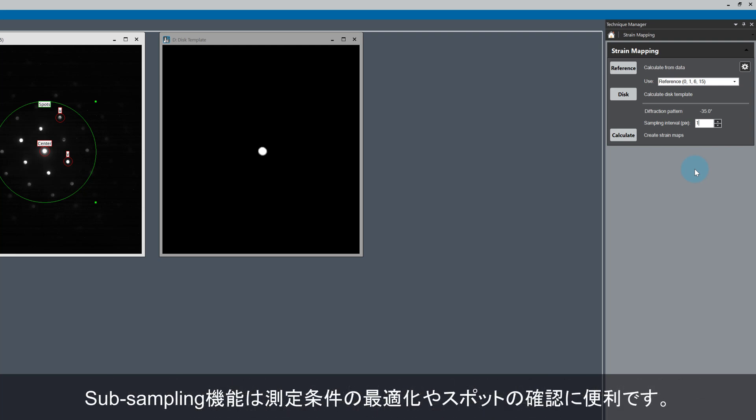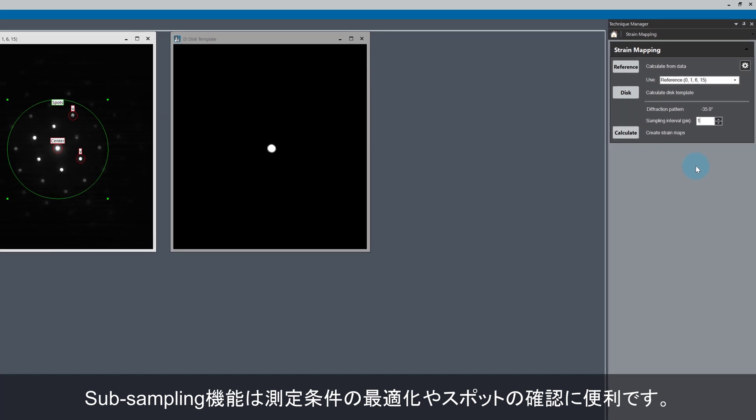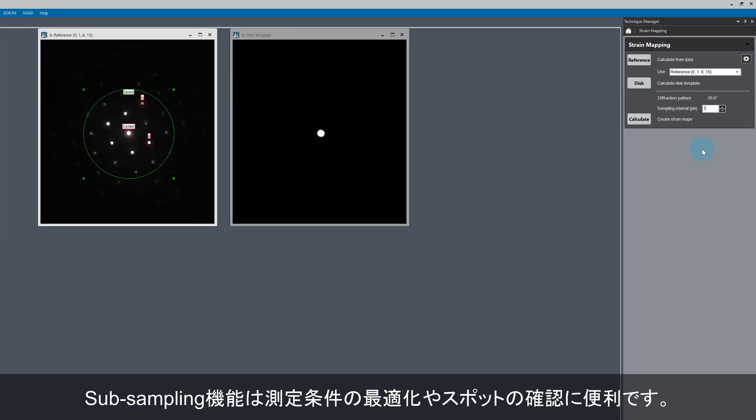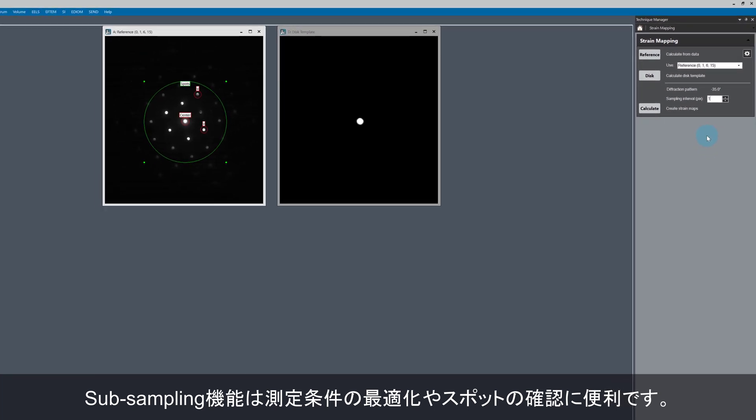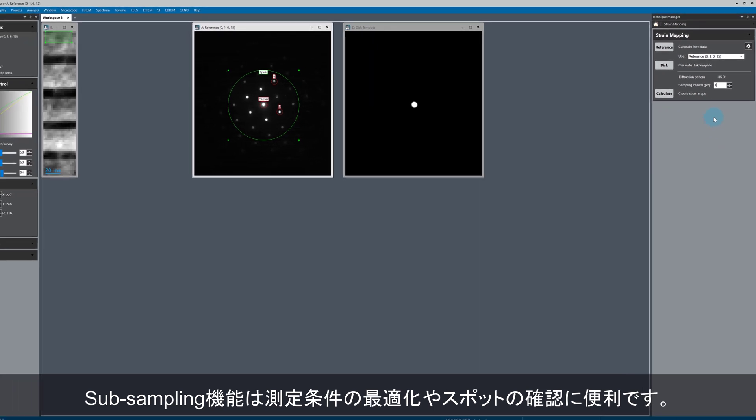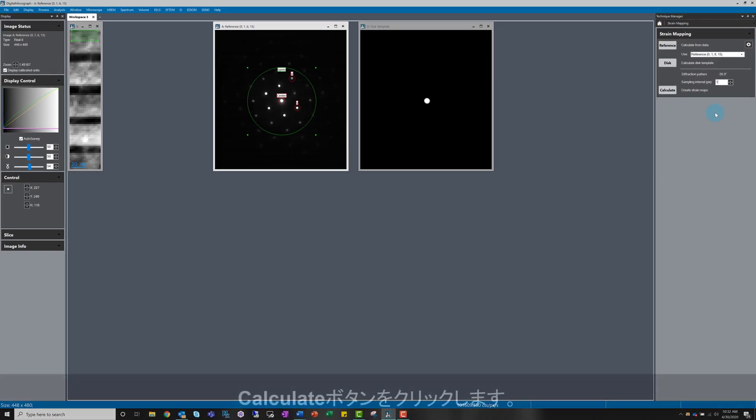Subsampling like this is a useful preprocessing or quick analysis step to screen the data. This is particularly beneficial mid-experiment on the microscope to verify the experimental setup is good for strain mapping. Okay, let's click calculate.